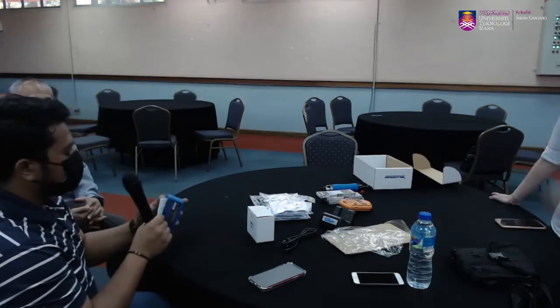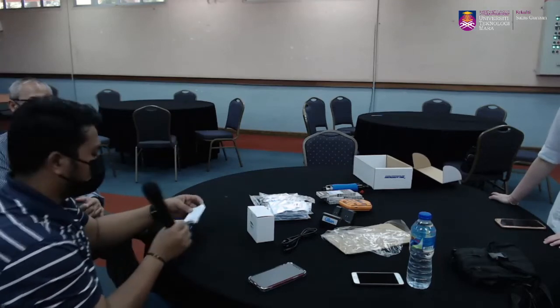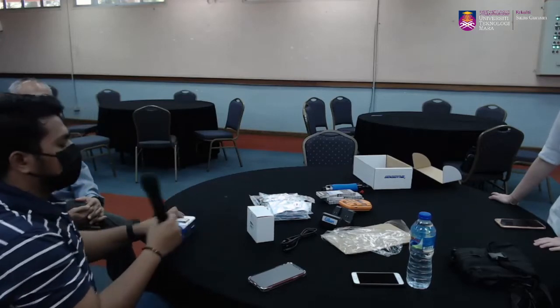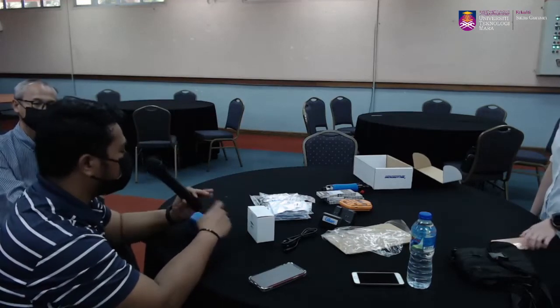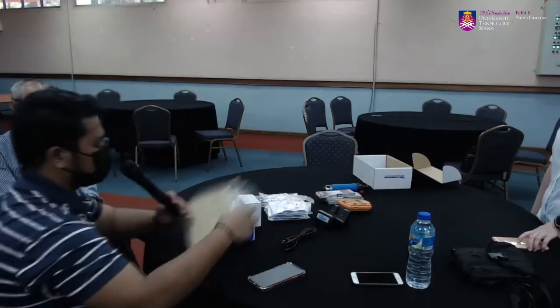Yes, you can send. Ataupun you nak I datang and check dulu before you hantar pun, takut ada you to miss out ke, boleh, tak ada masalah. Yes, tapi usually lama lah. It depends on cara you penggunaan. So kalau you penggunaan okay, filter dia tak ada apa-apa, any sample yang masuk dalam, should be okay lah. Filter tu is just to block all the things that you sample masuk ke dalam pump, yang akan rosakkan dia, to protect the pump. Yes, correct. Okay.